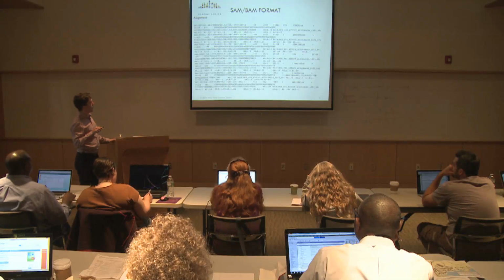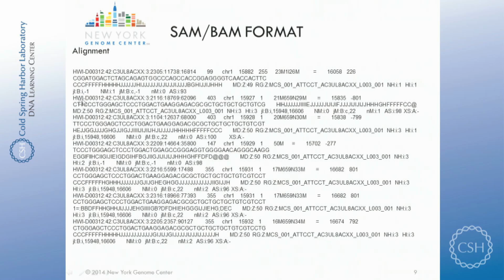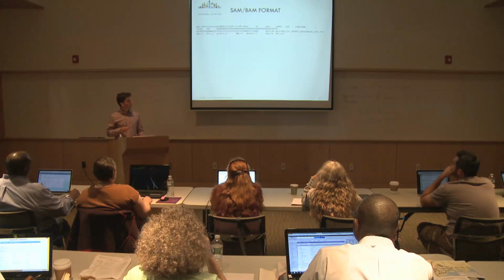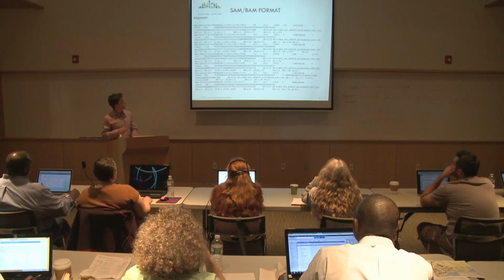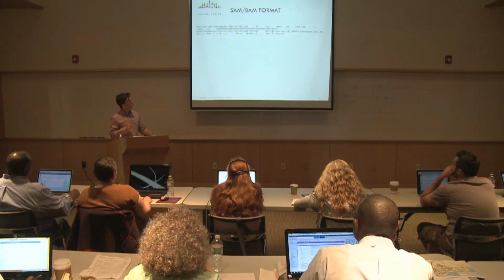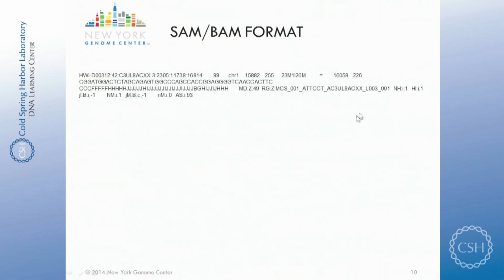And that's an alignment file, okay? So that's just the first 5 lines, and there are probably 10 million of them. So you can all read that, right? Yes. Okay, so it's the same, it's 4 lines again. No. So that's just one line, it just doesn't fit on the screen. Okay? So here is one line. Okay? Did you have any question? Somebody had a question? No?